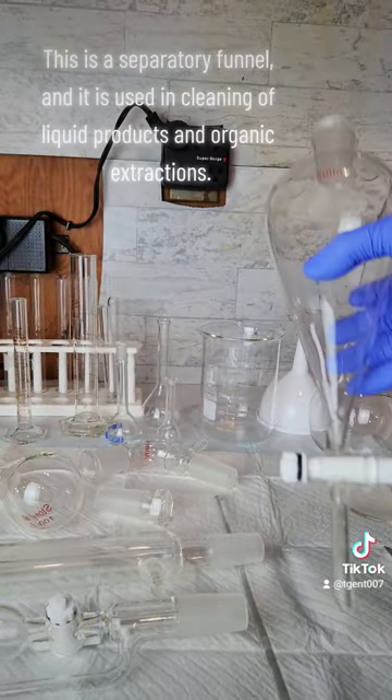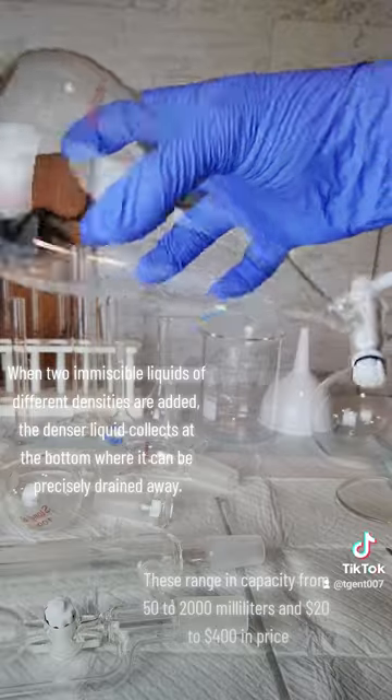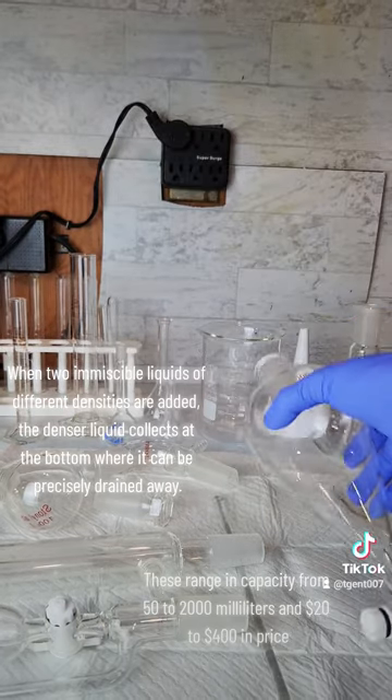This is a separatory funnel and it is used in the cleaning of liquid products and organic extractions. When two immiscible liquids of different densities are added, the denser liquid collects at the bottom where it can be precisely drained away.